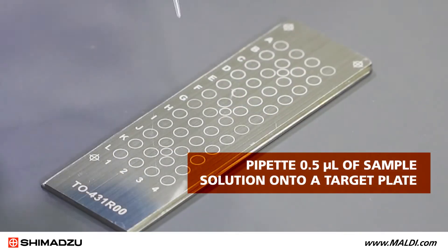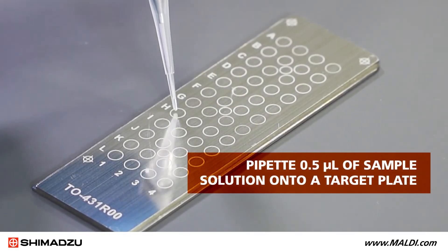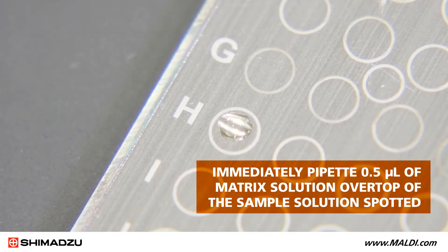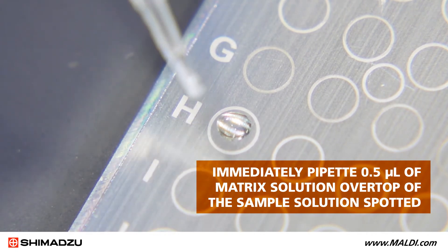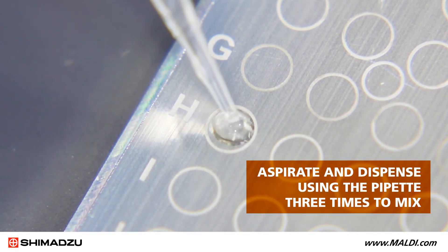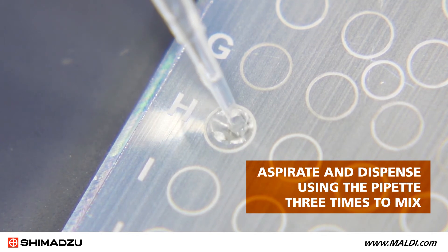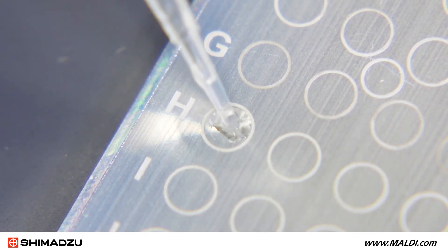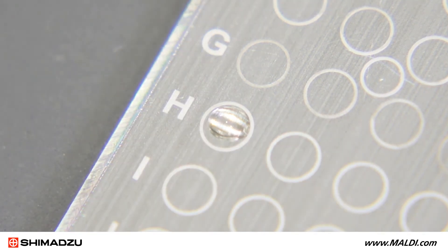Pipet 0.5 microliters of sample solution onto a target plate. Immediately pipet 0.5 microliters of matrix solution over top of the sample solution spotted. Then aspirate and dispense using the pipet three times to mix the sample and matrix. Allow the plate to air dry.